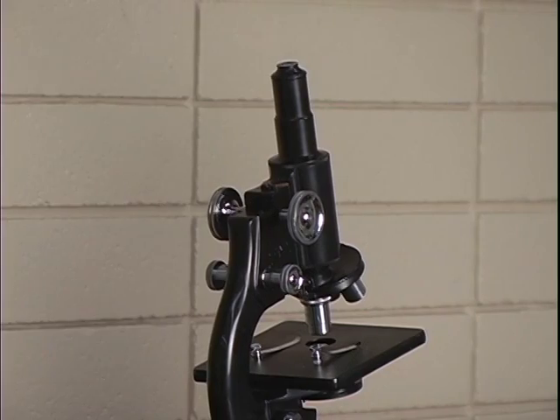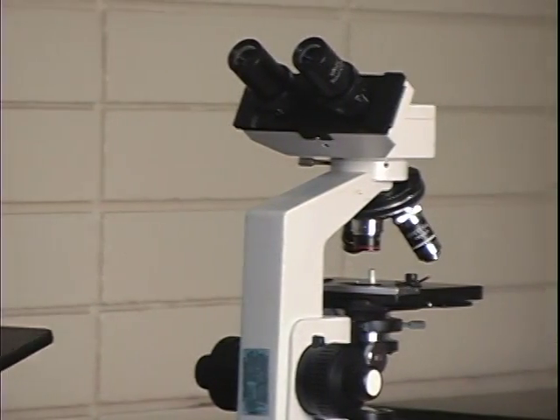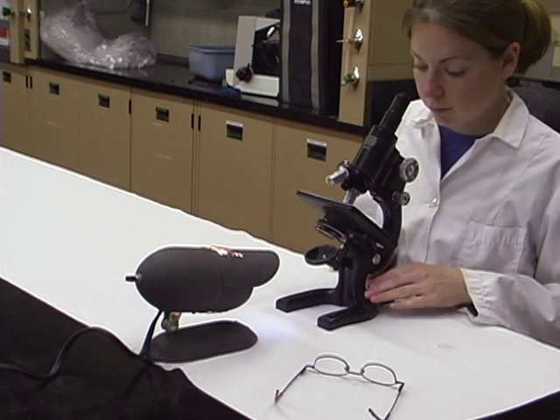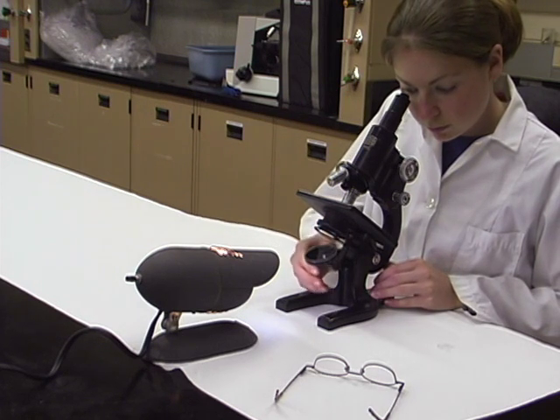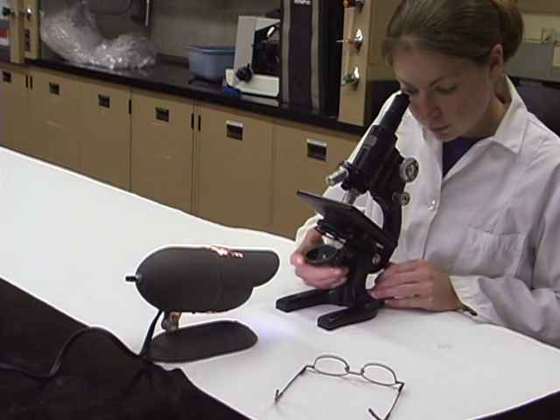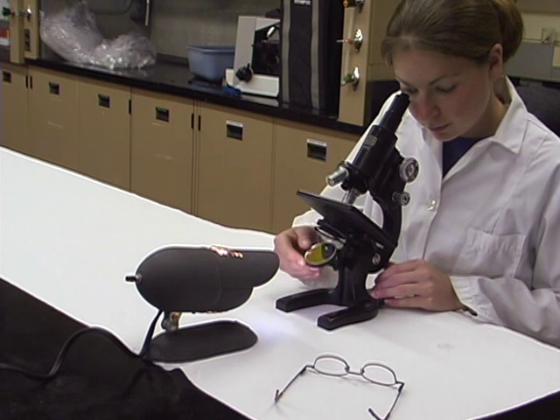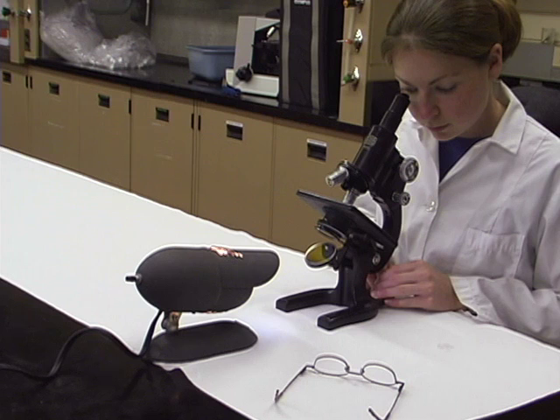Compound microscopes can be monocular or binocular. Monocular microscopes have only one ocular lens, and so only one eye can be used to view the object. Still, to prevent eye strain when using a monocular microscope, both eyes should be kept open.